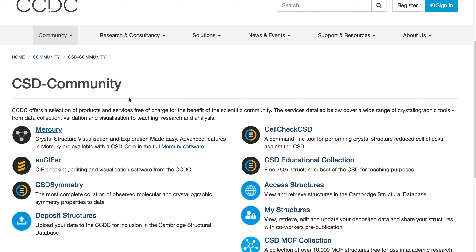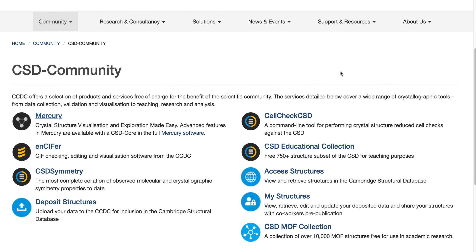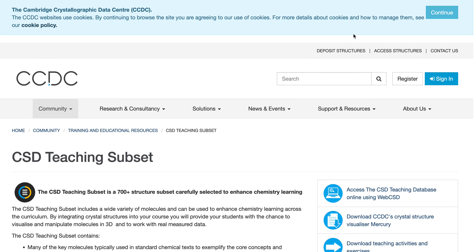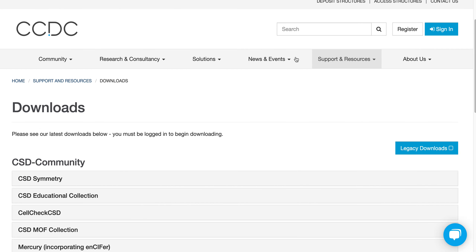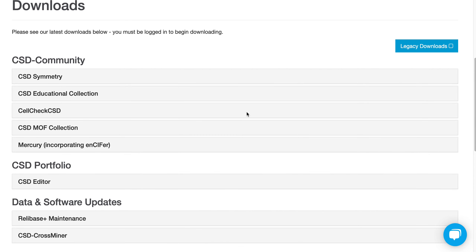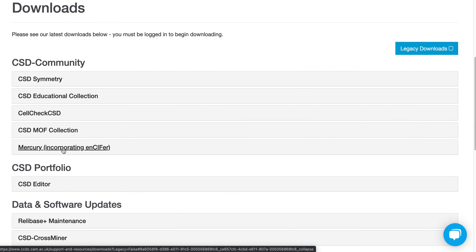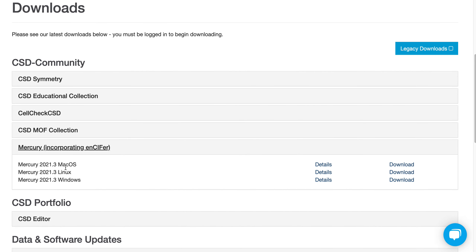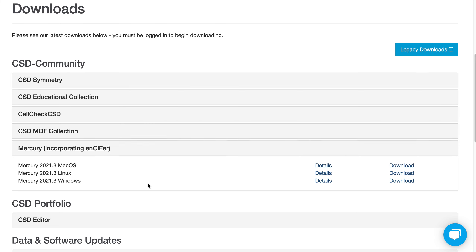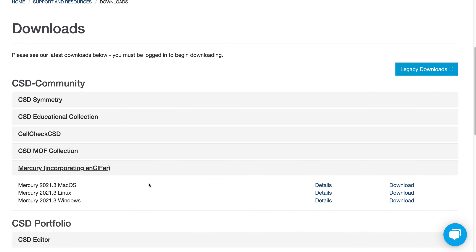To install it, they provide the so-called CSD community license, which essentially means you can just download it for free and use it for free. I will include the download link in the video description. It's basically this link, and you can download Mercury depending on the operating system you have.